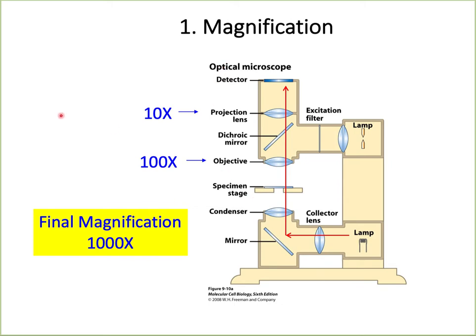So the light passes through the objective lens and then often gets additional magnification in this lens. It is a 10x, usually the most common one on most light microscopes. So in this example, it is a 10x, which is the eyepiece. Usually the eyepieces or the projection lenses, right here, the projection lens or the eyepiece, sometimes it's called the ocular. That can even be 15x or 20x, but usually never more than 20x. But the most common is a 10x.